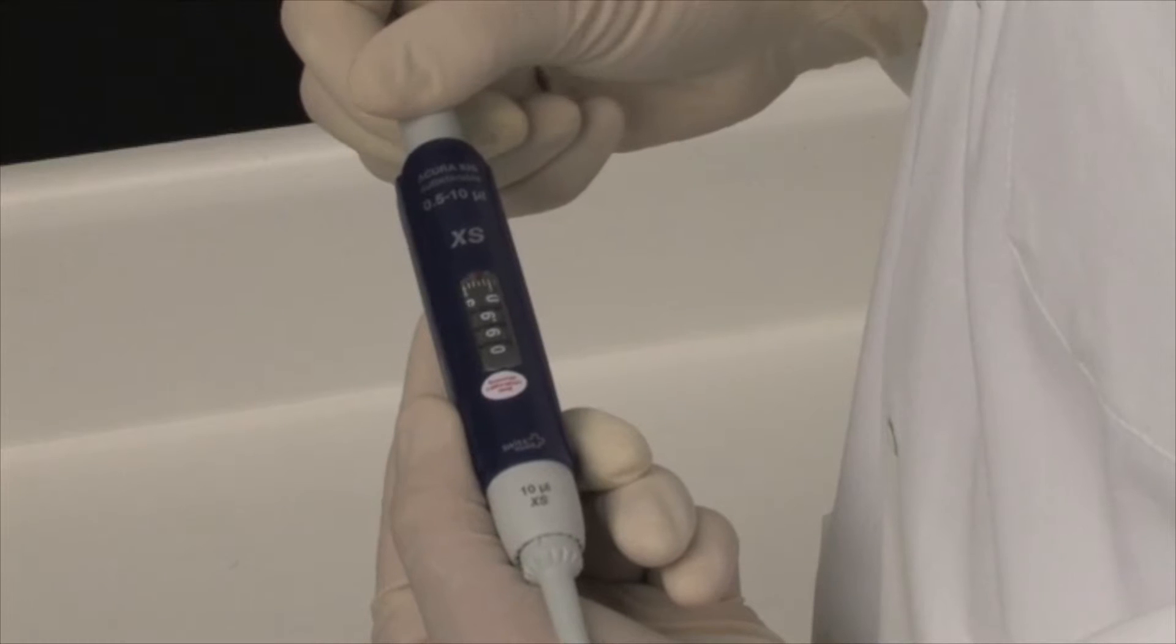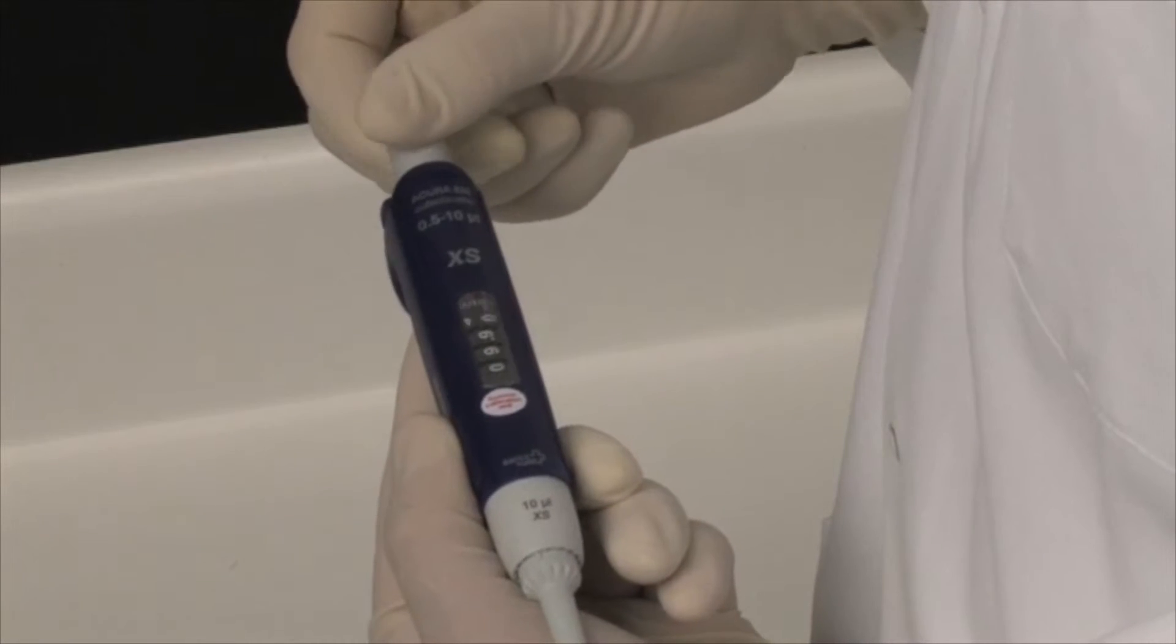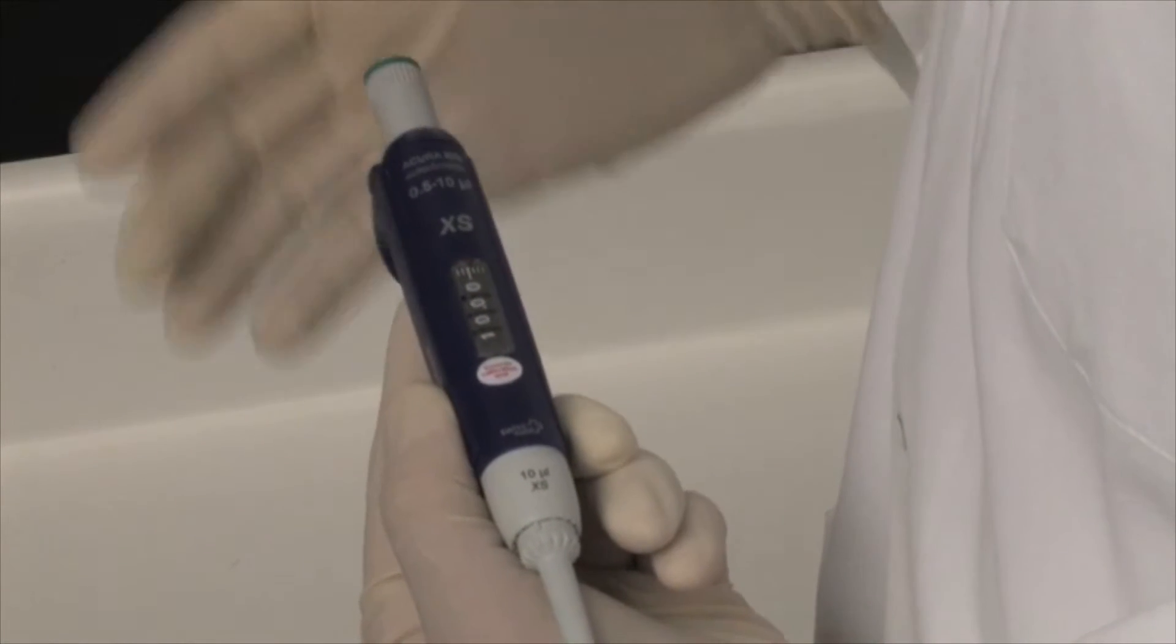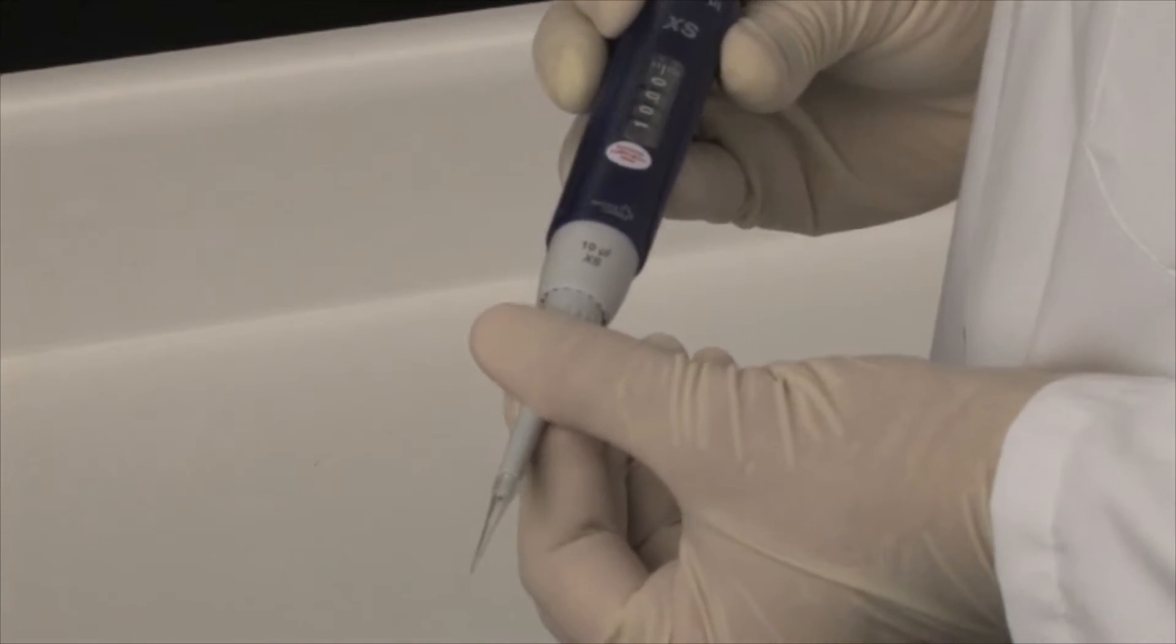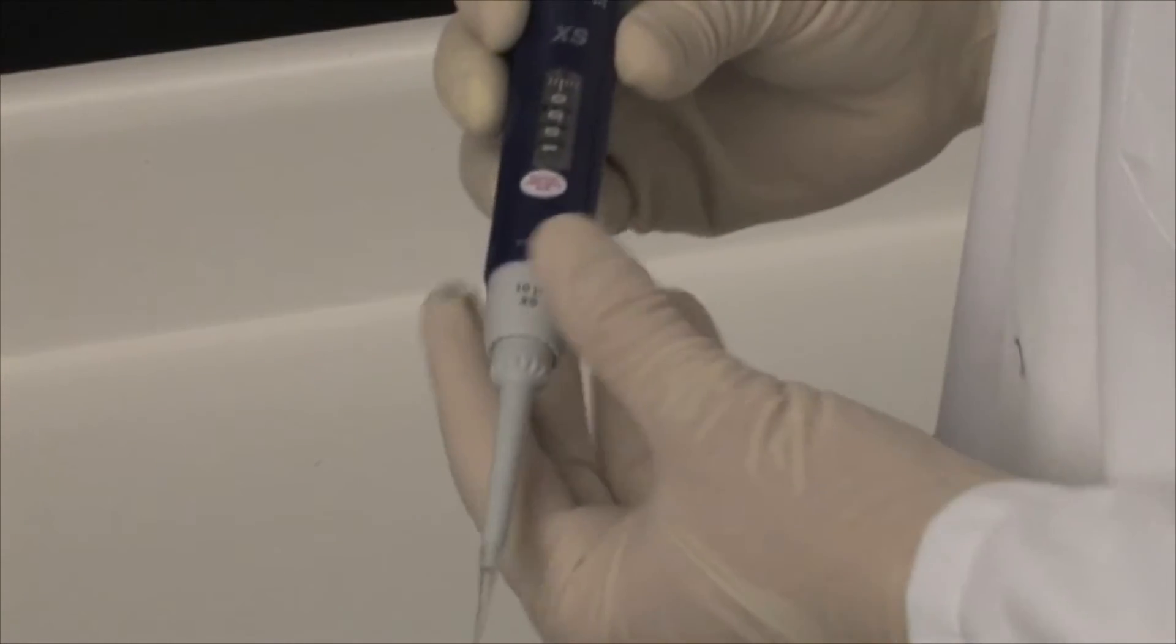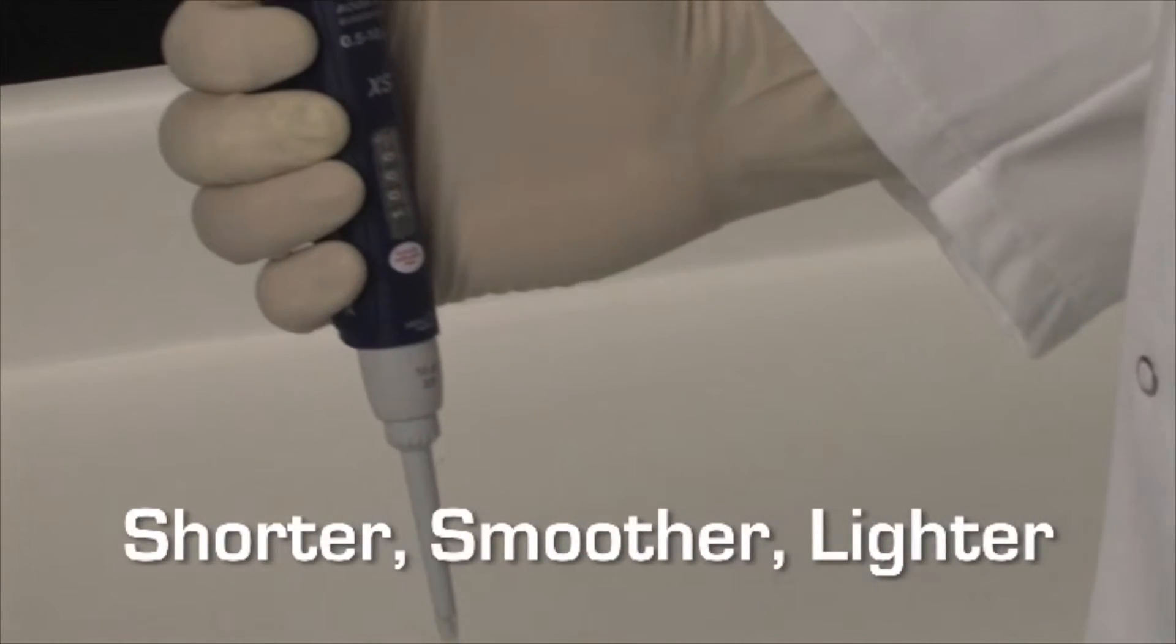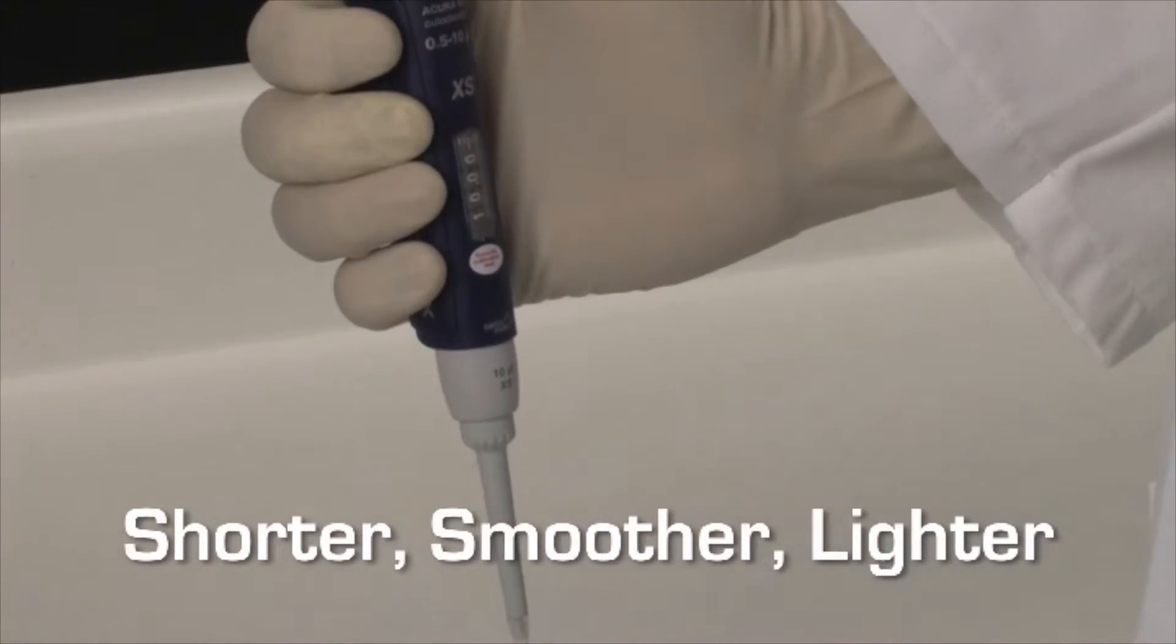While providing all of the standard features of the Acura manual line of pipettes, including precise setting and checking volumes, as well as user-friendly tip adjustment to accommodate a variety of tips, the 826XS is shorter, smoother, and lighter.